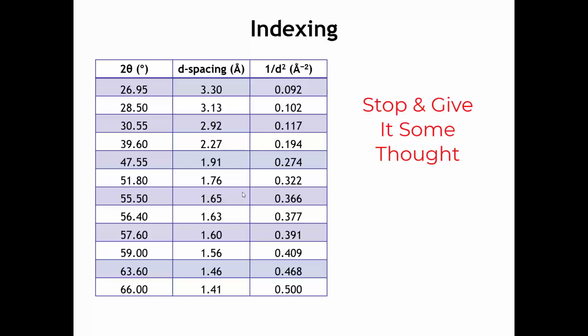One hint to keep in mind is that depending on the space group, we oftentimes might have some missing peaks. And in this case, there are some peaks that are missing, and the fact that peaks are missing does complicate the indexing process a little bit.